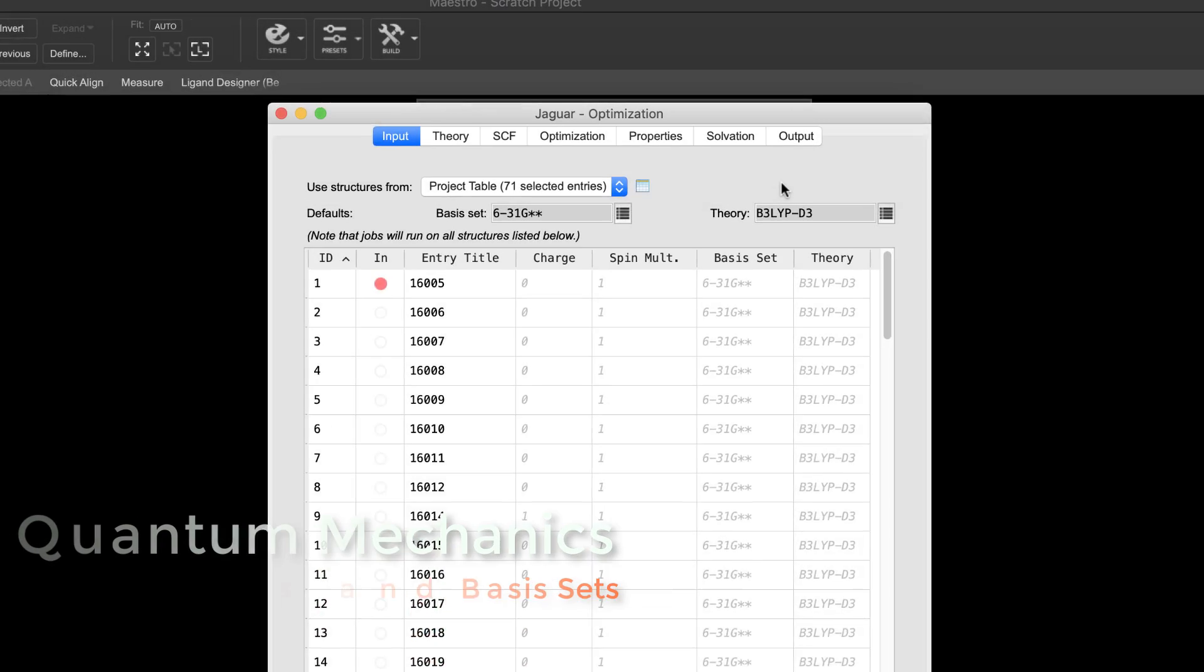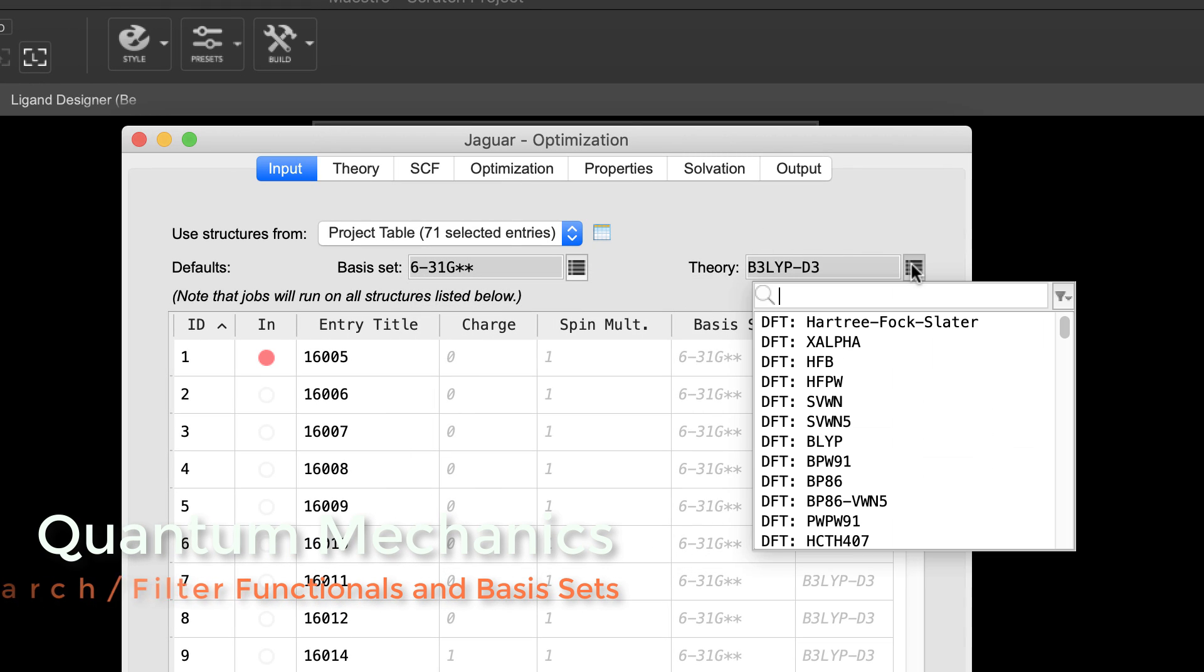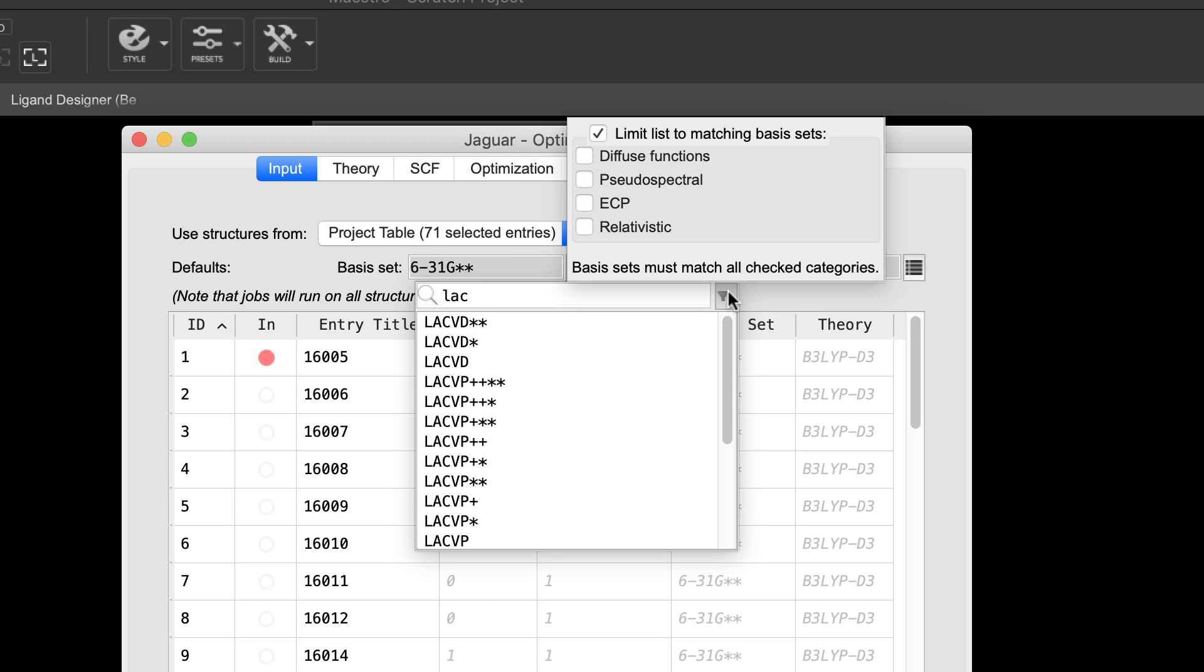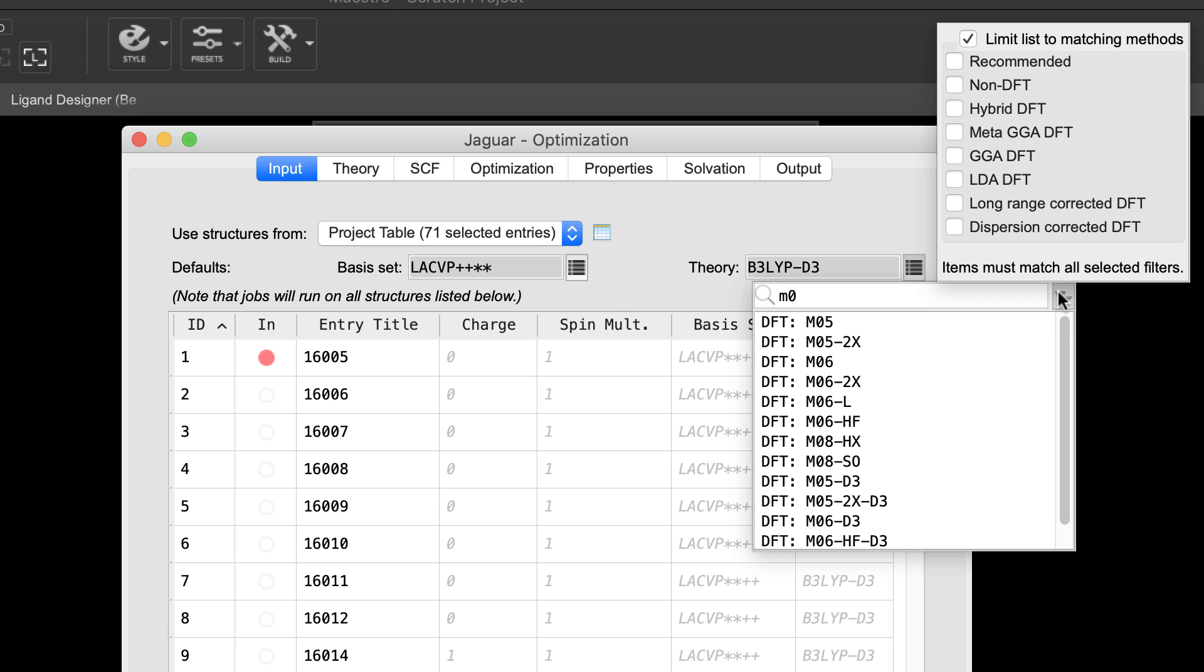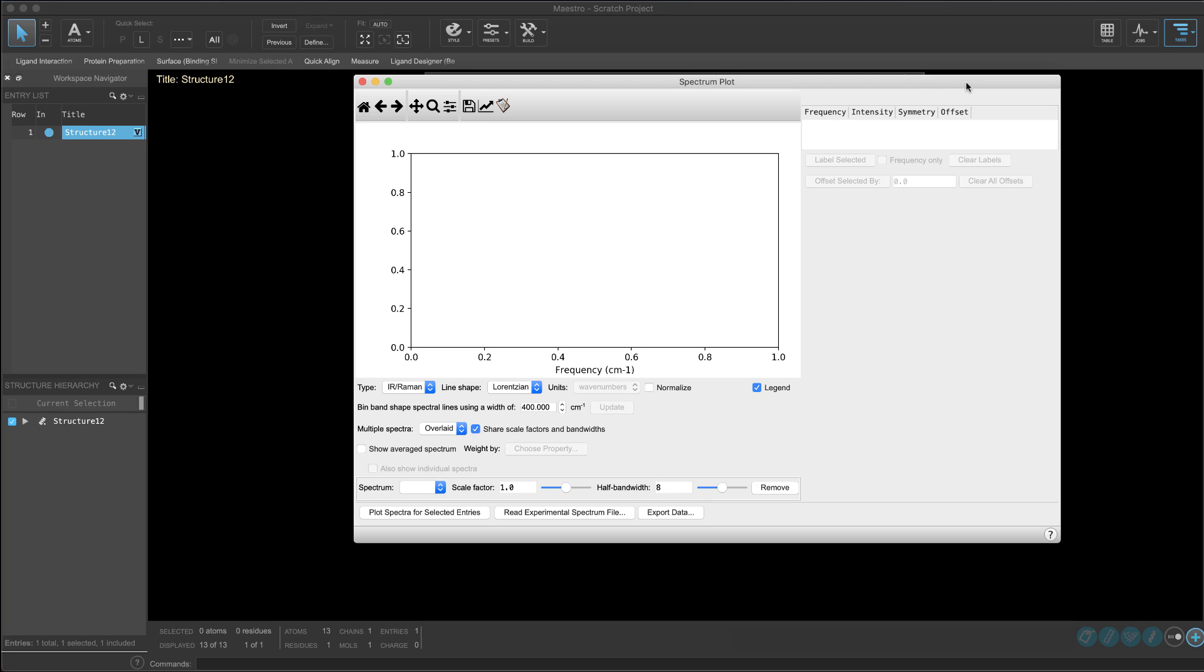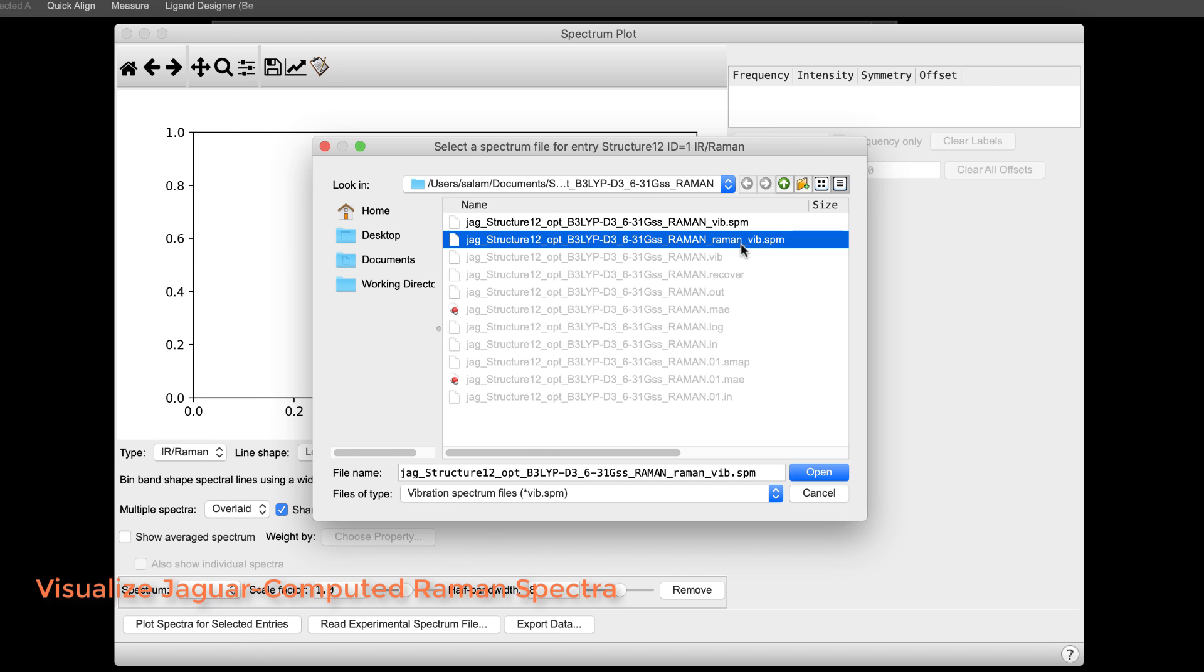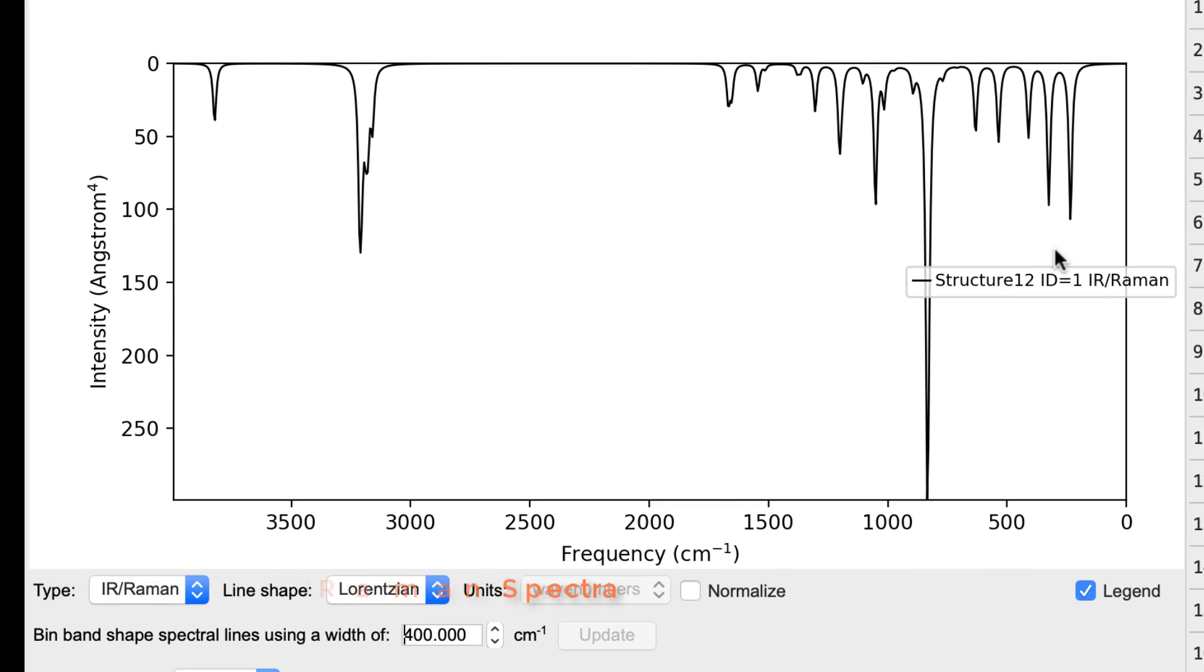In the Jaguar quantum mechanics panels, usability improvements have been introduced to the basis set and theory selectors. Easily type in your basis set or apply a filter to narrow down the selection. Similarly, use the search text box or filter button to list the available theoretical models. Also in QM, the spectrum plot panel can now visualize Jaguar computed Raman spectra.